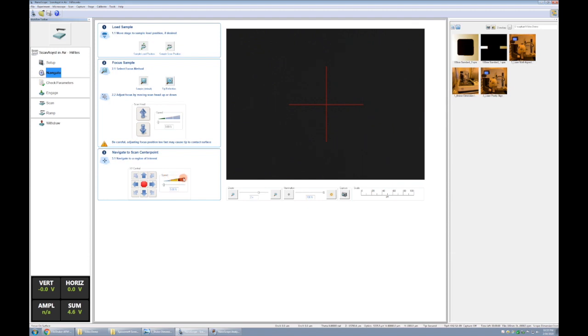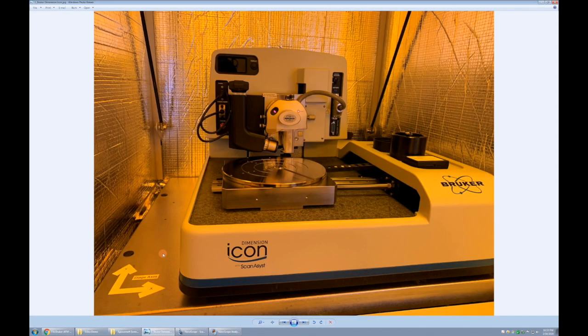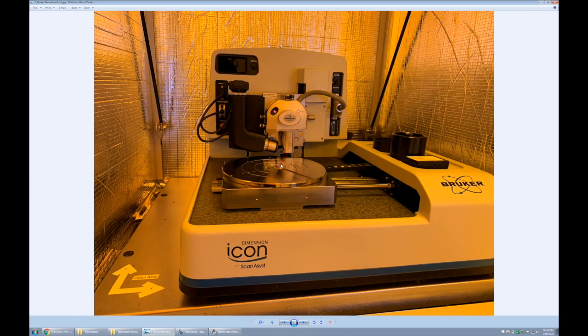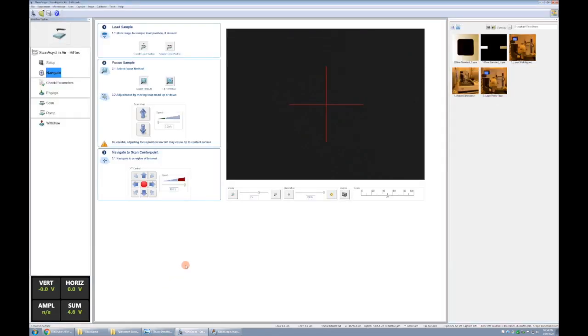To do that we're not going to go in order here. We're actually going to start down here by driving the X and Y stage. If we look at this picture here, this is what our system looks like. We have our stage axes labeled, so first we're going to drive the stage in the positive Y direction until our sample, which is somewhere around here, is underneath the scanner.